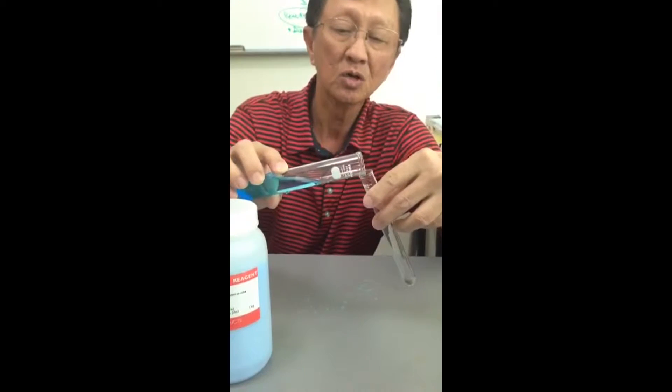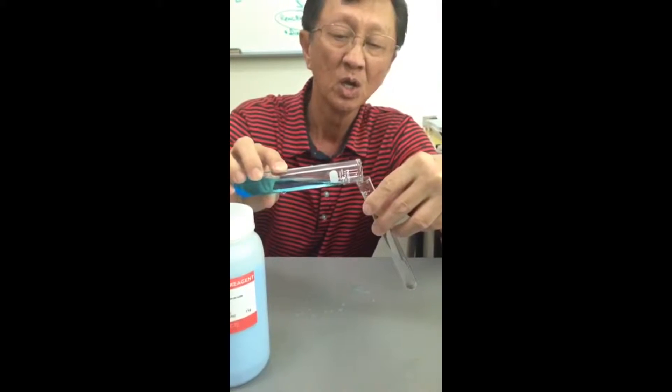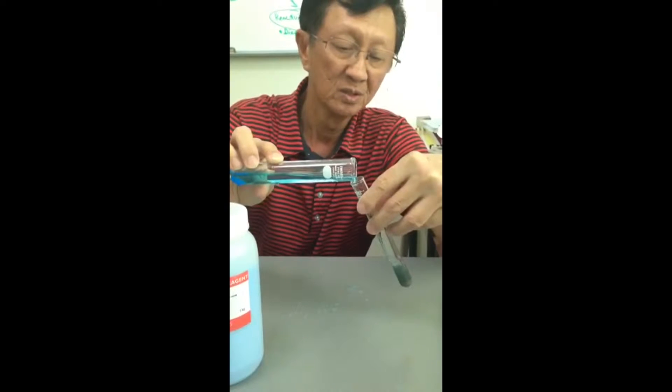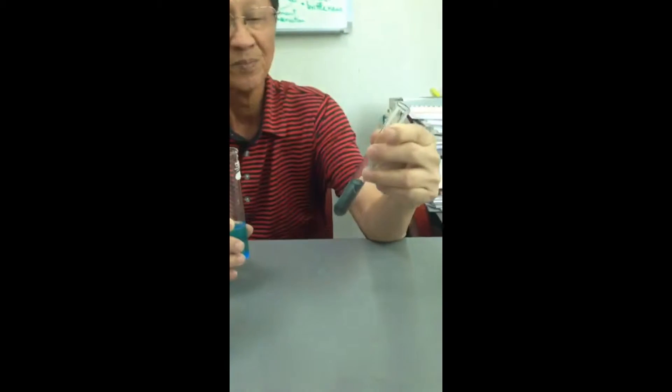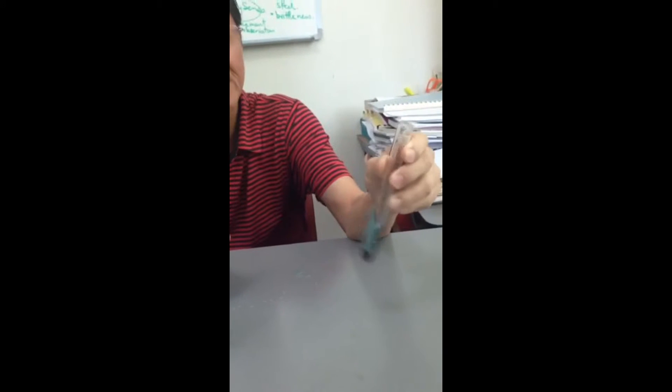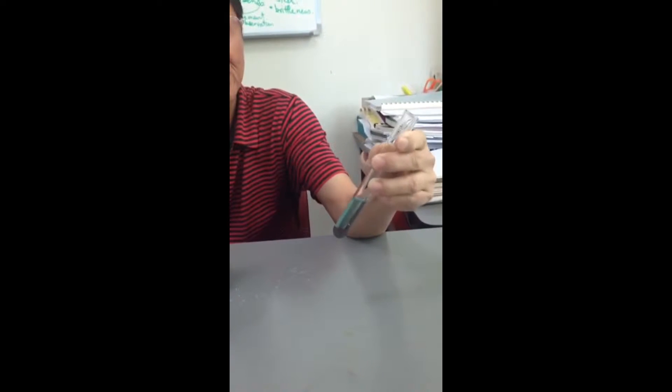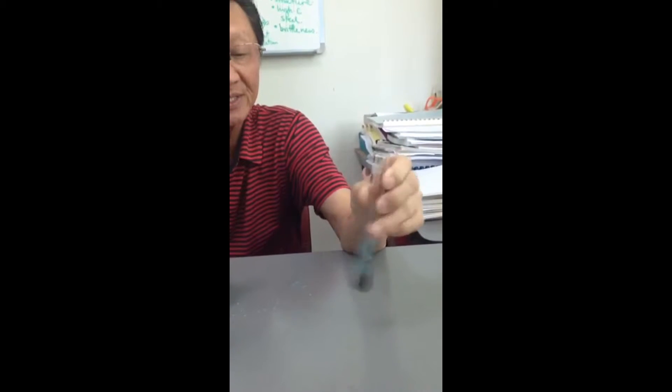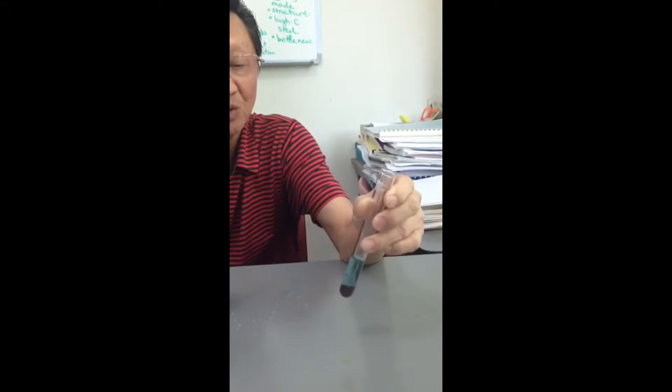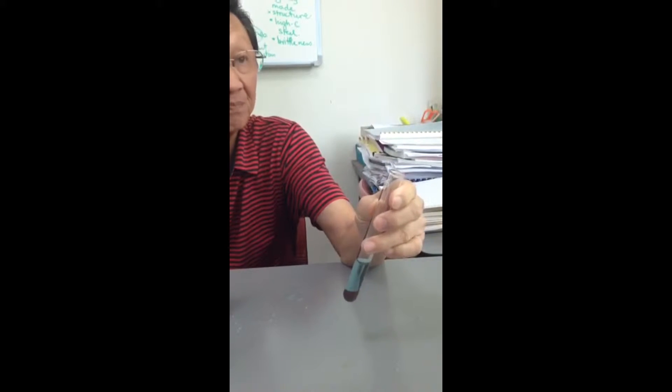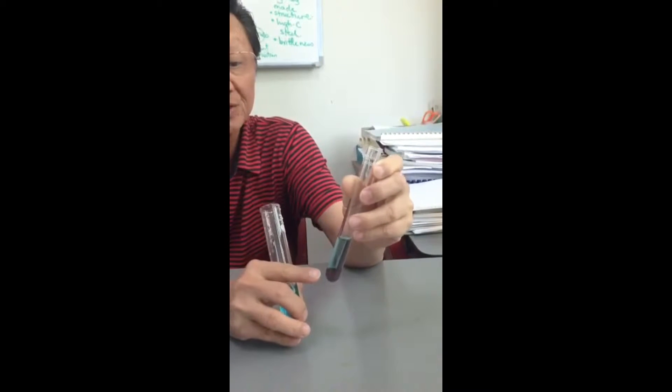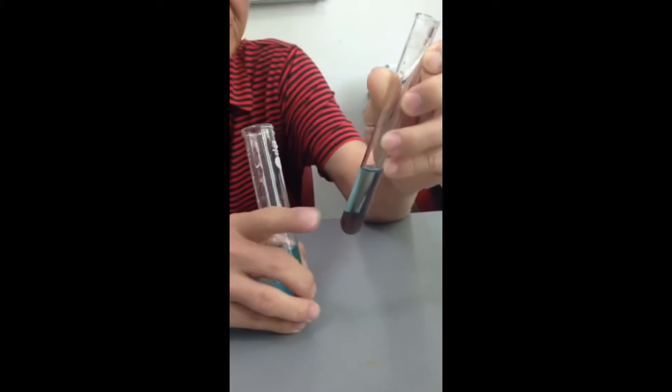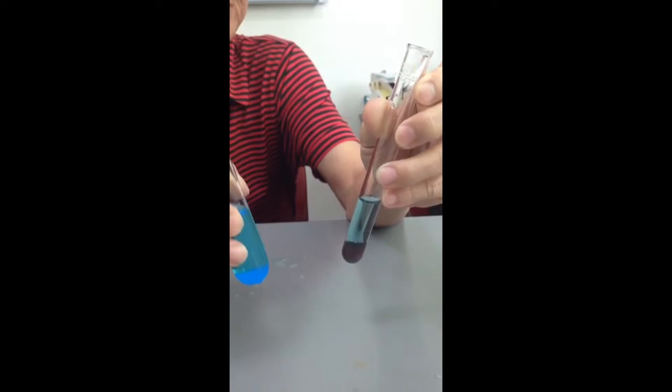The blue copper 2 sulfate solution will turn color. Can you see that it is turning? The blue color disappears. And the reddish color that you see is the copper that was displaced from here.